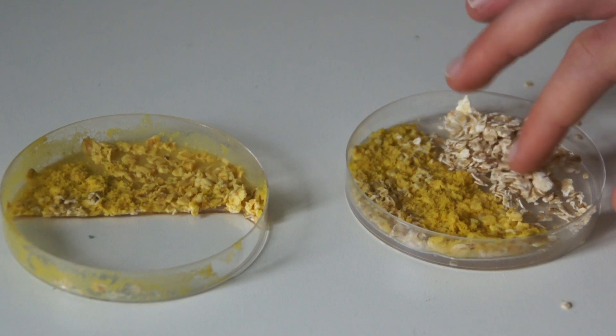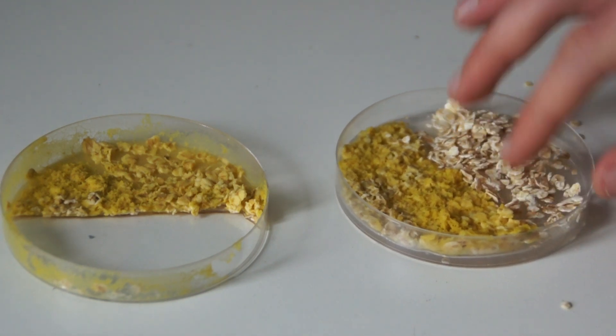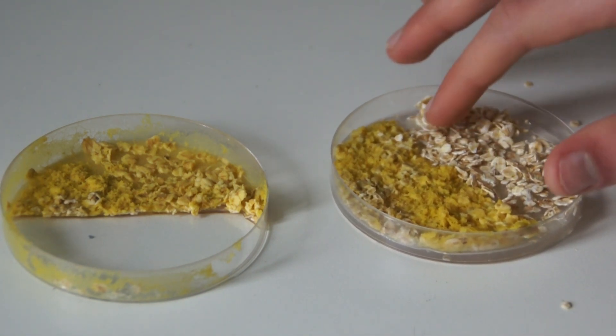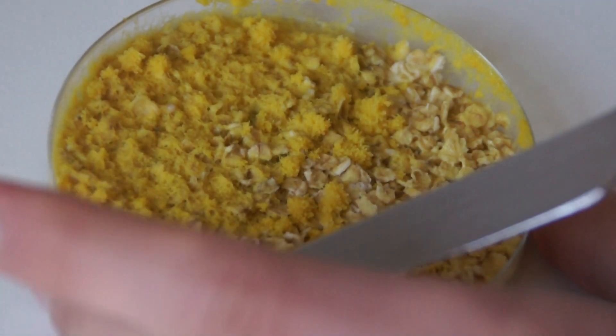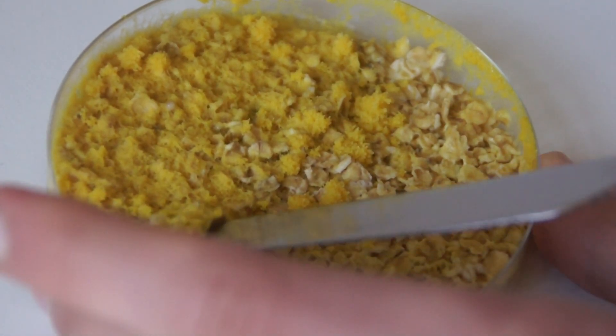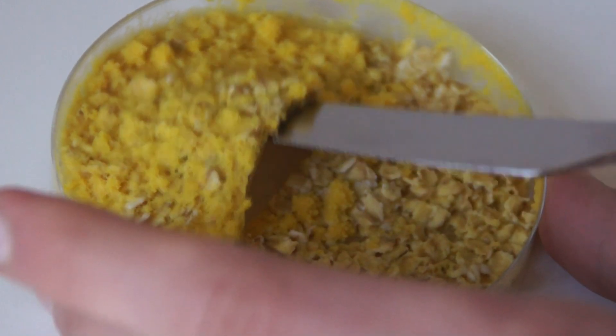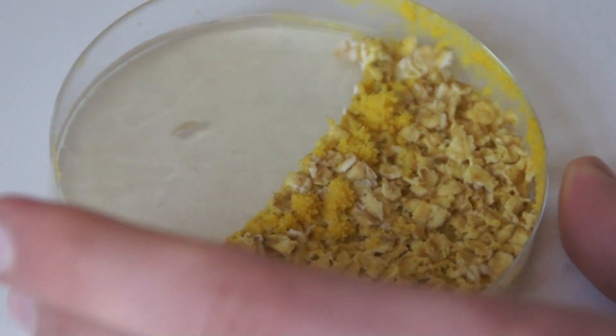Cover the other half with oat flakes. 24 hours later, the blob should have doubled its size. Remove the top part using a spatula or knife.